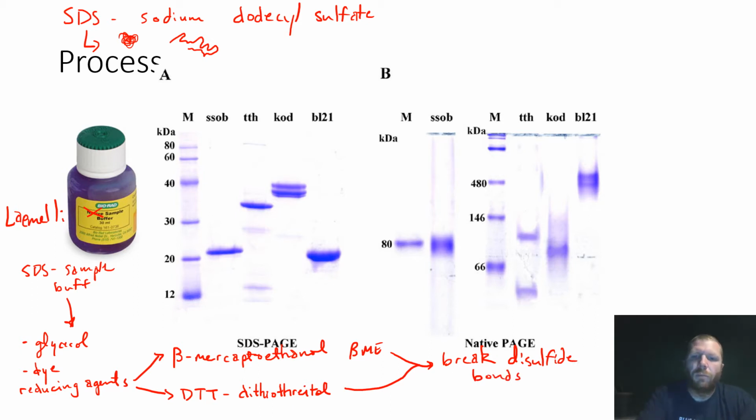So we're going to be breaking those disulfide bonds, and so what's going to happen is this protein right here, the SDS is going to cause it to go from that globular to that shape, and then from here it's going to go to something that's linear. That means all of the positively charged and negatively charged residues are exposed to the environment.